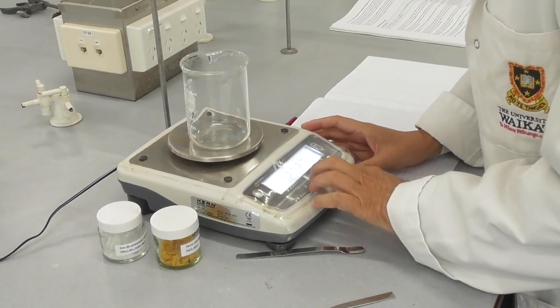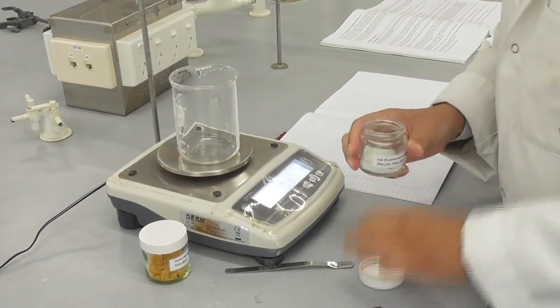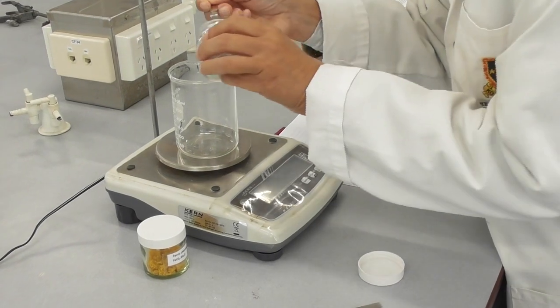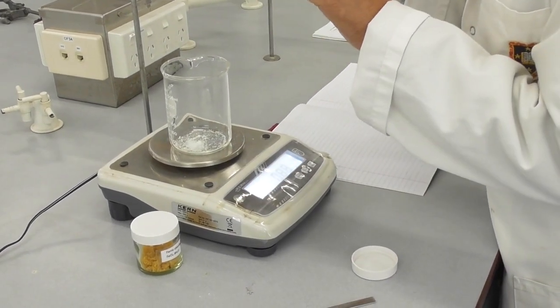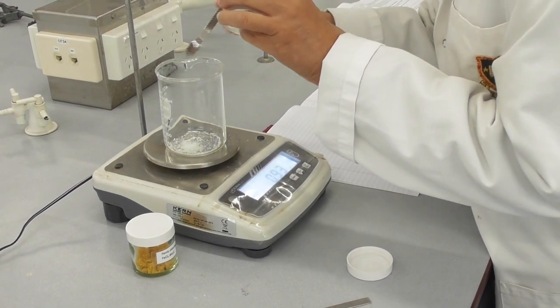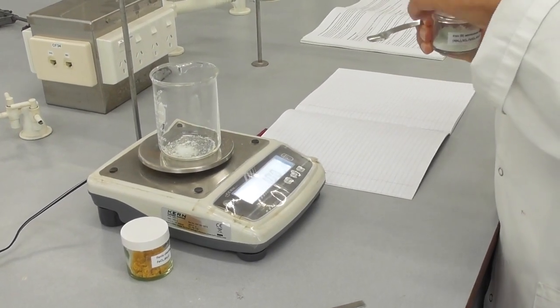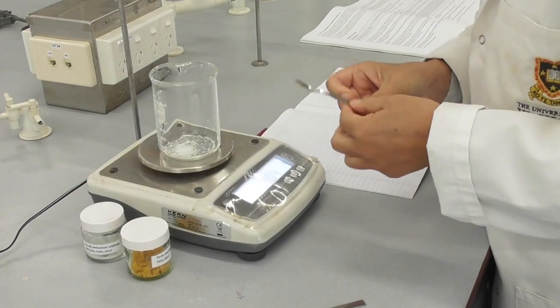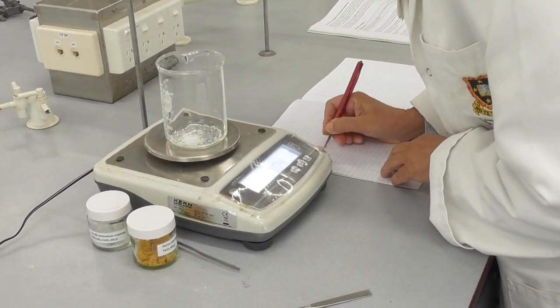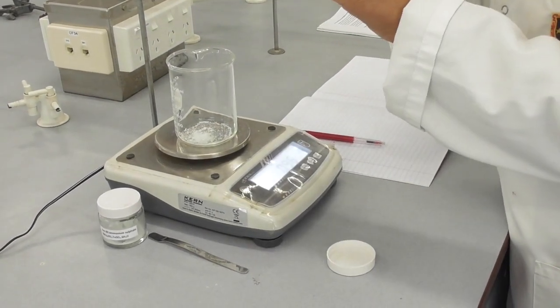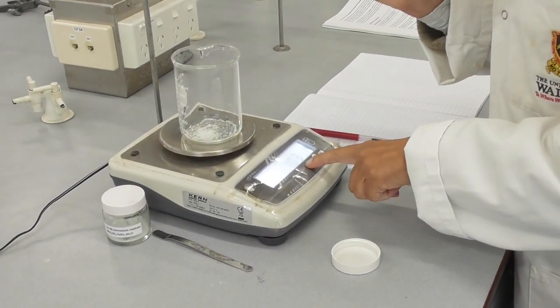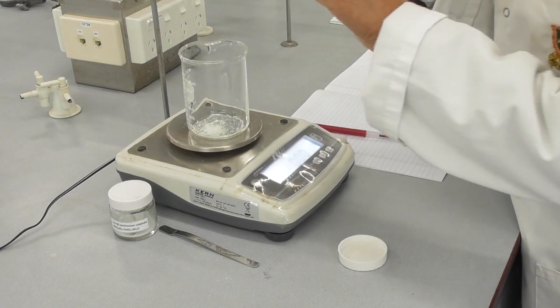I start by weighing the two iron salts into a 400 milliliter beaker. First I add 1.00 grams of ammonium iron sulfate into the beaker. Then I need to weigh out 1.38 grams of the second iron compound, which is iron chloride.